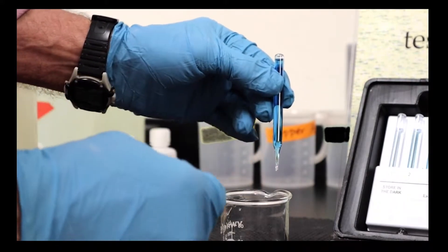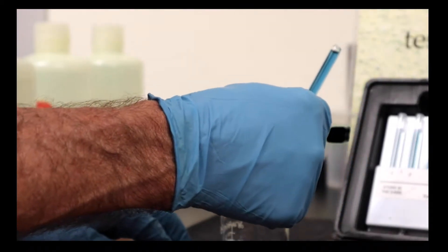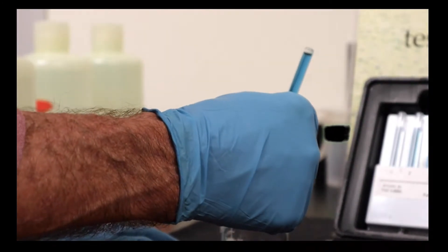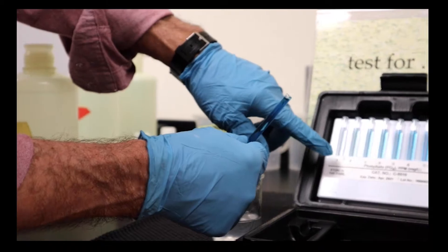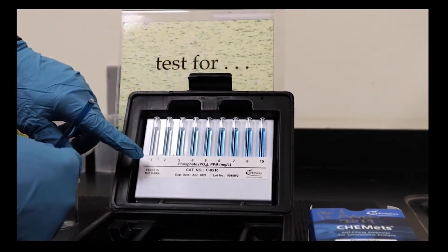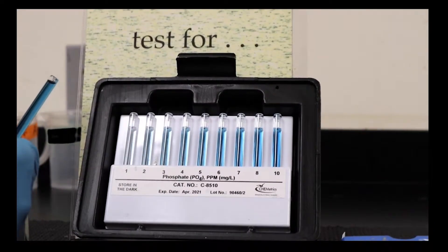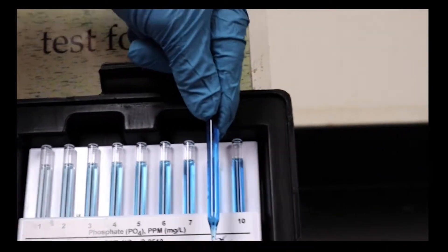What we're going to do is hold this up so we can compare it to what we have in these test tubes. Each of these is calibrated to give you the color from 1 ppm to 10 ppm phosphate, and let's see where we wind up being.